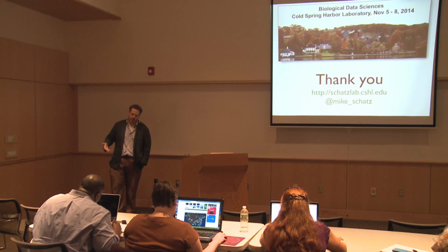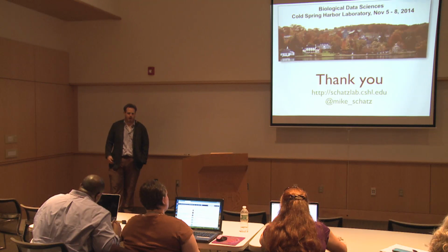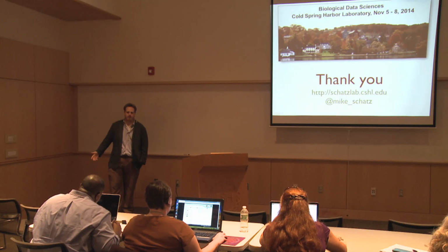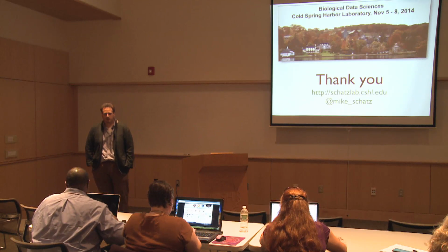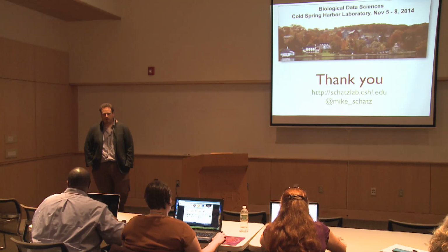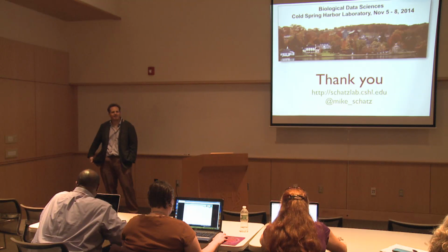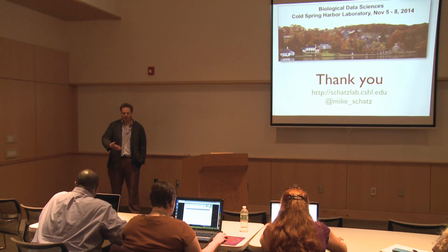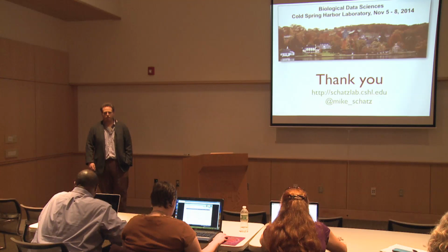We get contigs that are hundreds of kb to megabases. The only gap is if we have extremely deep PacBio coverage, more than 50x. There are some other algorithms that are really optimized for that, just expensive to use. Would it be okay even if the organism you're using doesn't have a sufficient reference genome already? Yeah. We do tests in genomes where we know the right answer just so we can check along the way. But the goal for all of this is to extend it to the next genome where there's no reference available.